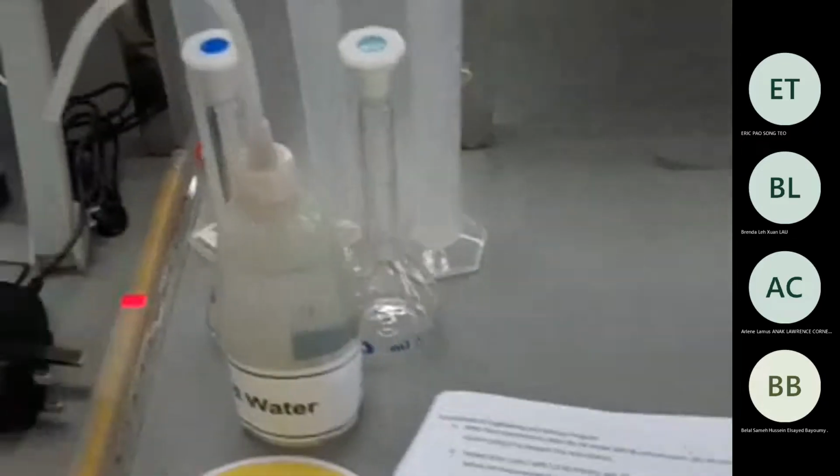Can you cancel these values? These values were given previously, and we will not use these values for this semester. We will use what we get. I mean, this was fabricated, so today we will get whatever we get from the lab, from the experiment. We will find the pH, and from that pH, we will find the hydronium ion concentration. How do you find it?